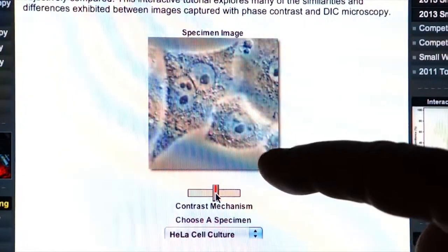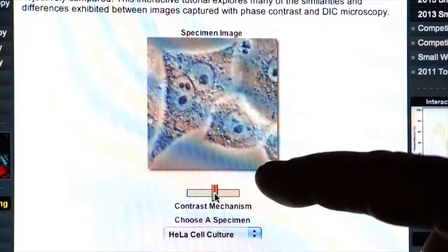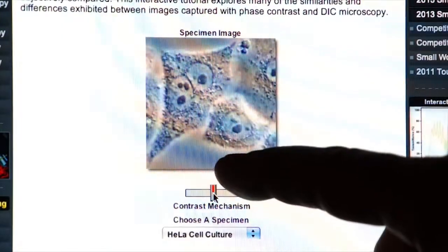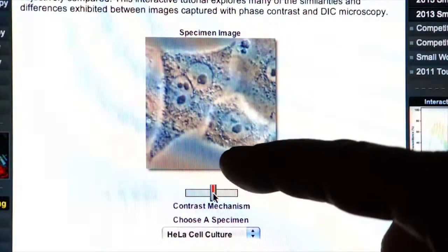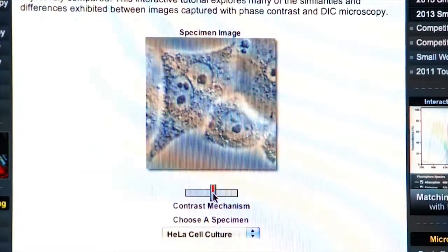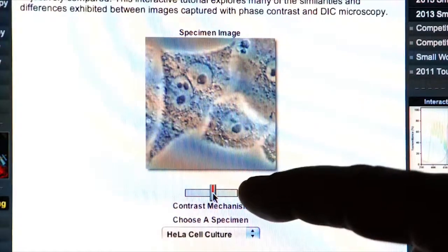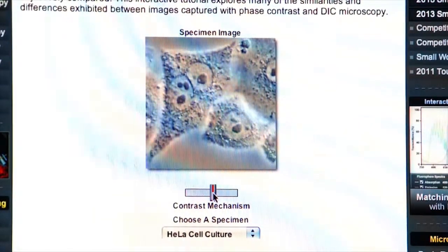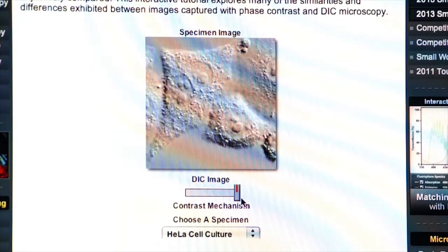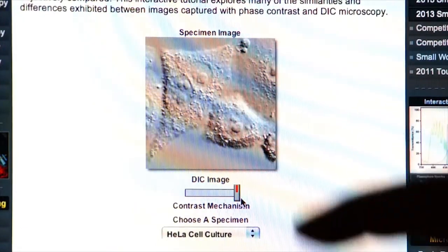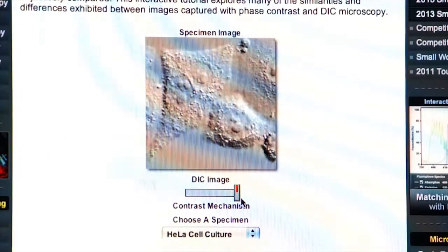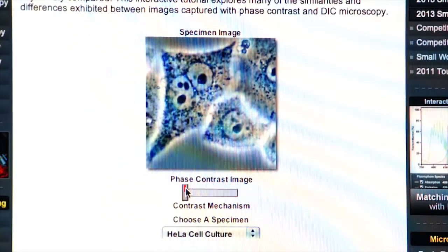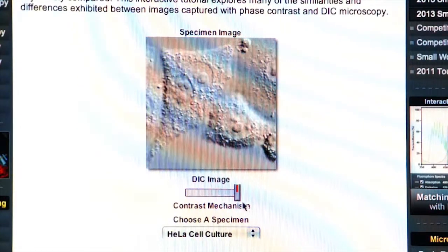Another form of contrast, an optical staining method in the microscope, is phase contrast. We do not have phase contrast on this microscope. However, I wanted to show you the difference between phase contrast on live cells and DIC. DIC looks like this with live cells. Phase contrast gives a lot more contrast, but sometimes it's not as useful as DIC.